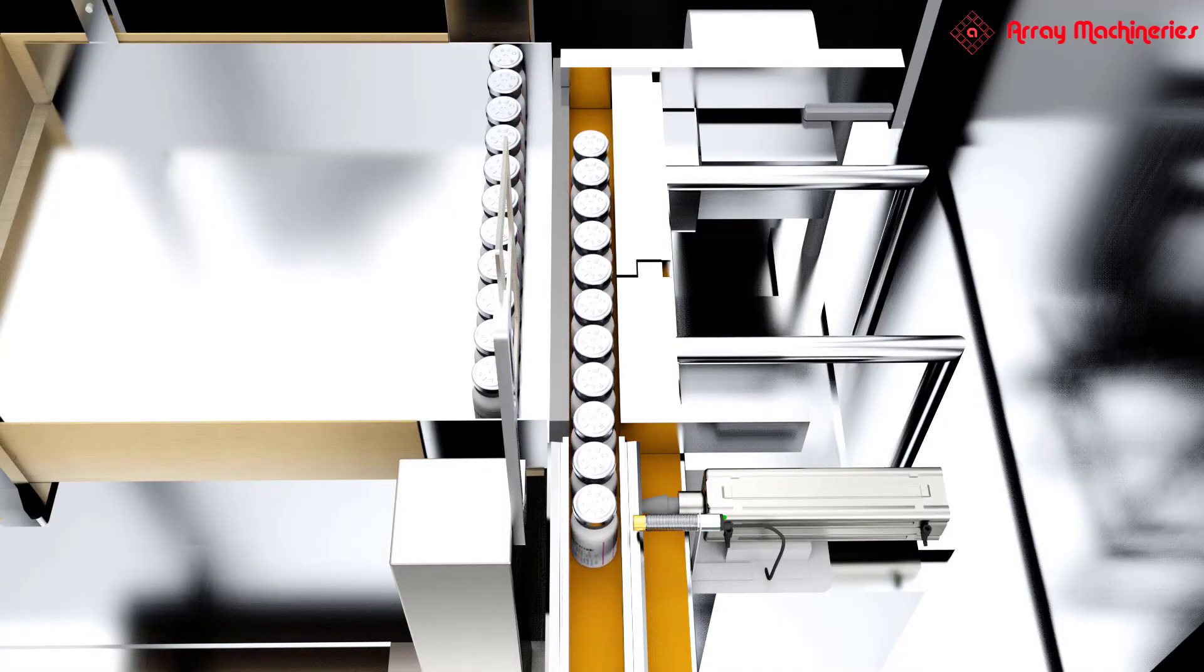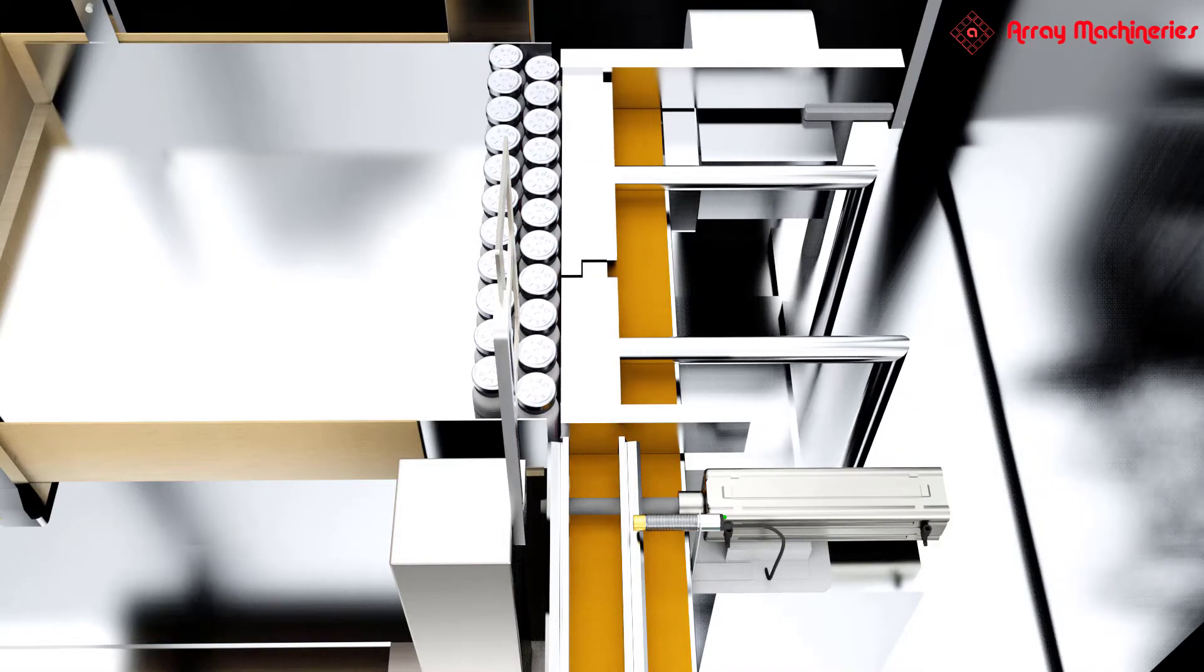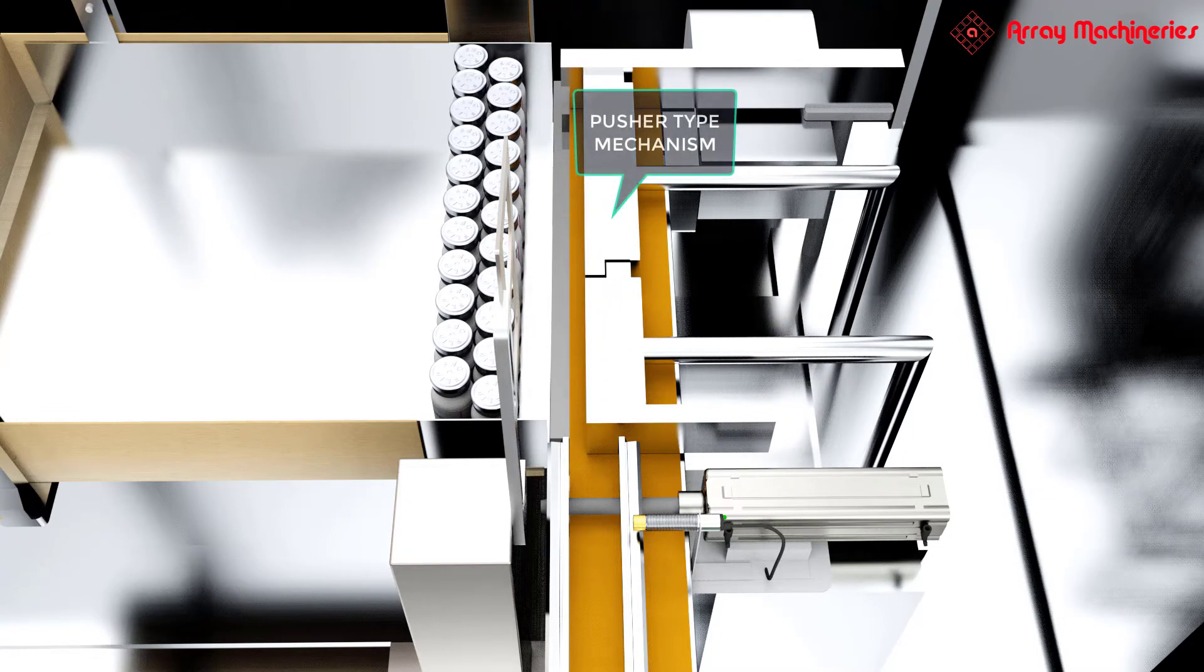Once vials reach the end, the servo conveyor stops. A pusher type mechanism pushes all vials onto the tray.